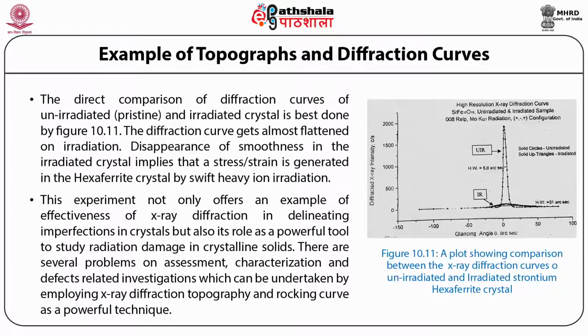There are several problems on assessment, characterization, and defects-related investigations which can be undertaken by employing X-ray diffraction topography and the rocking curve as a powerful technique.